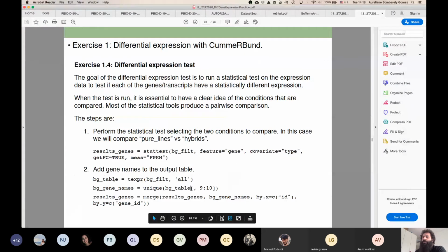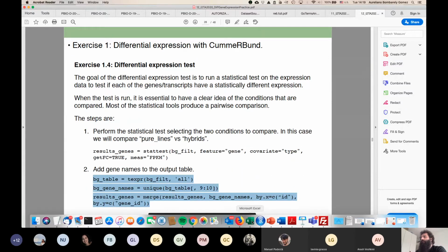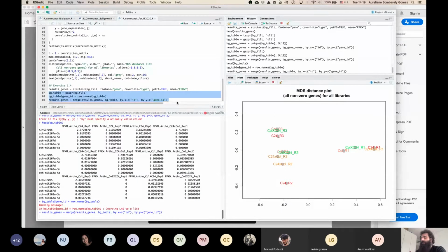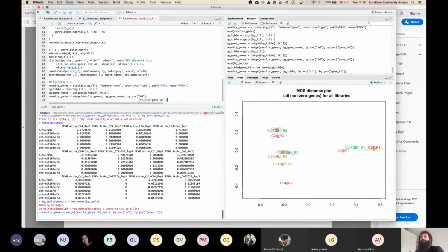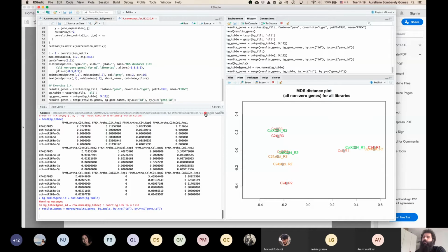Okay. So I said we can still keep this as it was, because in this case I can see that we only wanted to have gene names. So let me go back here and replace this by the original one. At least it gives you some idea of how we can change. If for some reason you need to stop this, we can try this. Okay, perfect. So let's run this again.